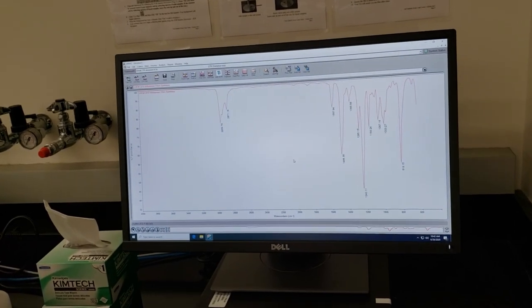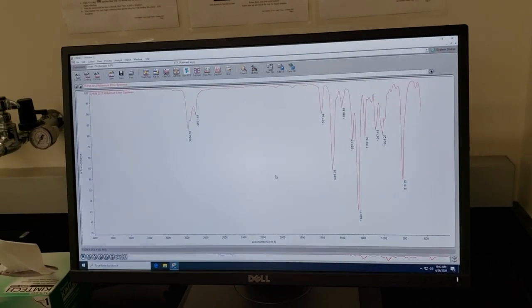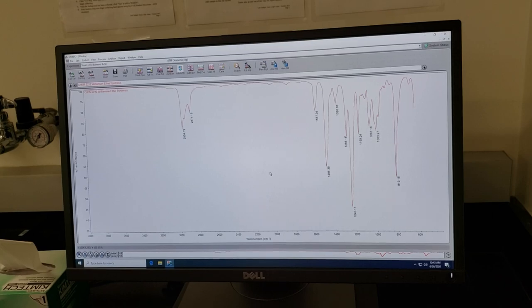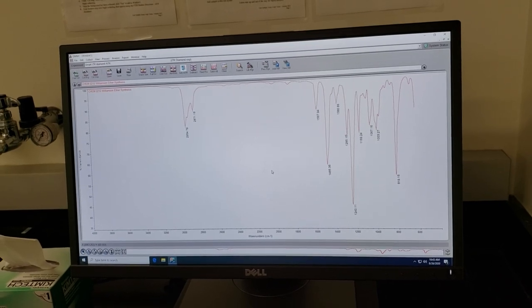We'll go ahead and post this to ELC so you can use both the IR for your product and your starting materials to help you with your lab write-up. Let's move over to the NMR now.